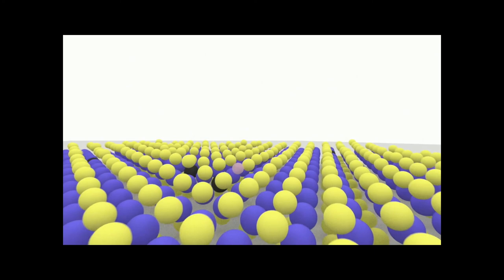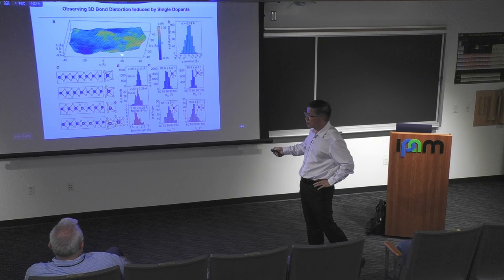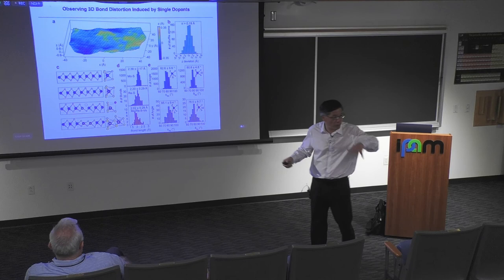So this is called a 2D material, but actually it's three dimensional, and there are a lot of deviations. You can see this ripple; the 2D material actually looks like this. These are all the atoms of the rhenium or molybdenum. You can see there are ripples.